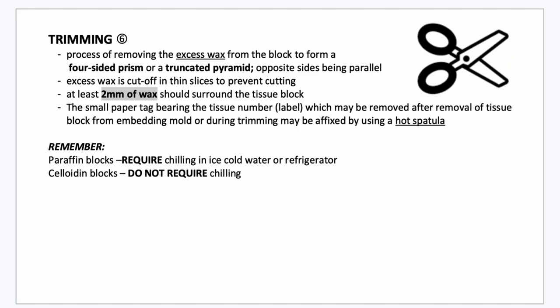Excess wax is cut off in thin slices to prevent cutting into the tissue. At least 2 mm of wax should surround the tissue block.